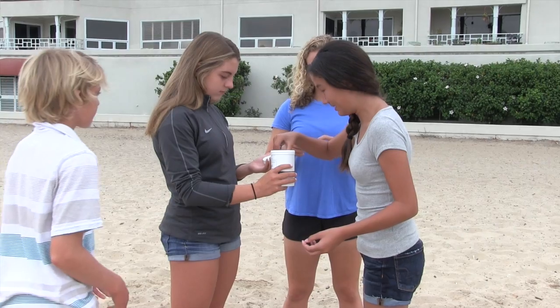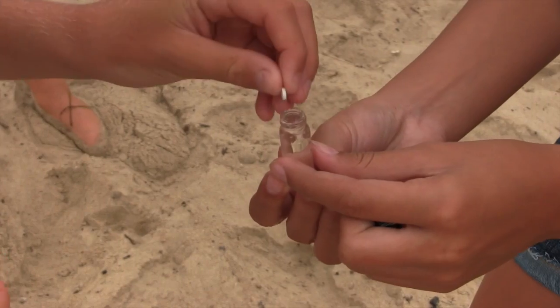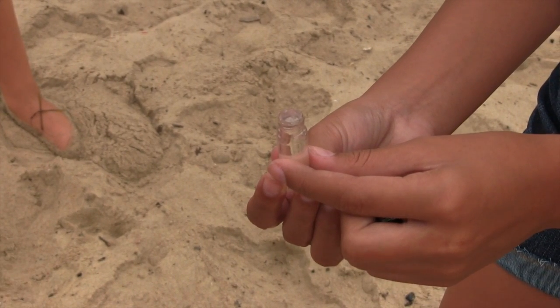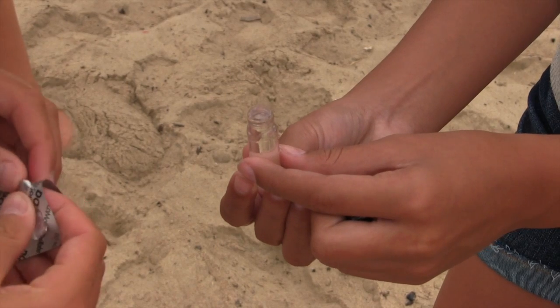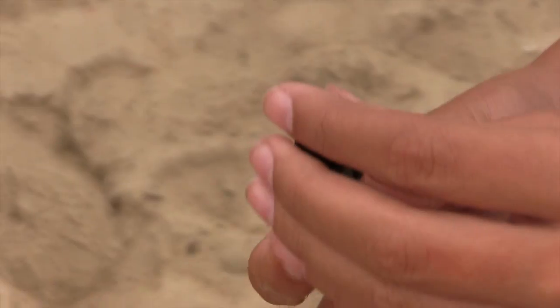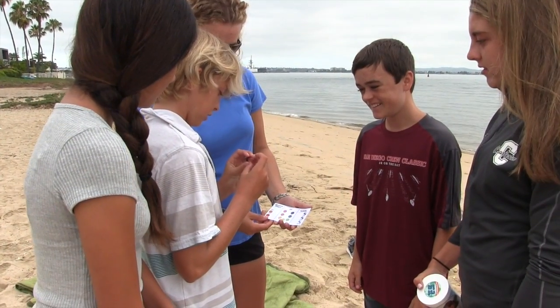Submerge the small vial into the water sample. Carefully remove the vial from the water sample, keeping the vial full to the top. Drop 2 dissolved oxygen test tabs into the vial. Water will overflow when the tablets are added. Screw the cap on the vial. Make sure no bubbles are present in the sample. It will take about 4 minutes for the tablets to dissolve.